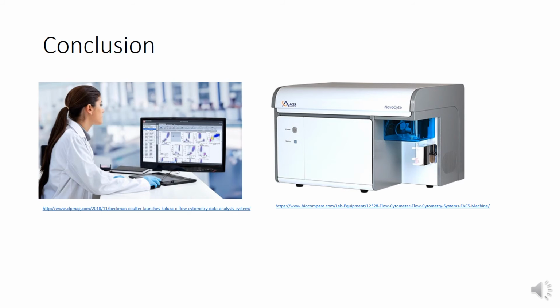Future directions include more complex quantitation of marine groups through image-based analysis of internal standards to allow for environmental concentrations to be taken. And the removal of sheath fluid also allows for the complete characterization of samples. Since there's a large amount of sheath fluid in traditional cytometers, it dilutes the sample by up to 100-fold with each successive analysis, which makes characterization difficult. The little amount of sheath fluid needed here and the fact that it is only needed in the first measurement means that the VCFC can measure the sample multiple times without worrying about dilution.